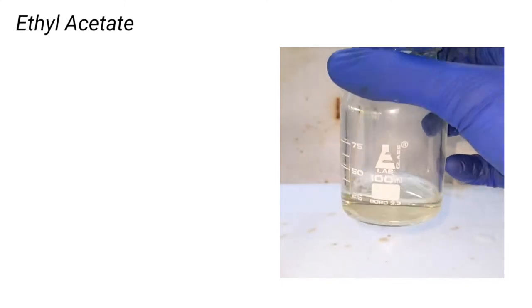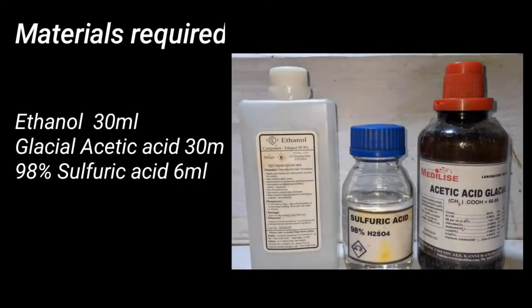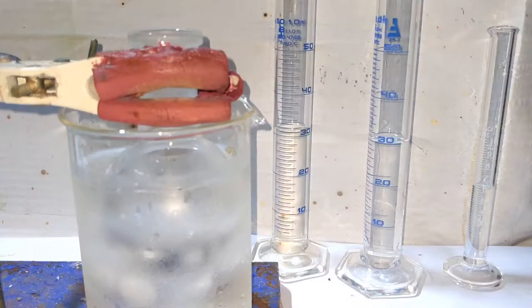Materials required for this preparation include 30 milliliters of 96% ethyl alcohol, 30 milliliters of glacial acetic acid, and 6 milliliters of 98% sulfuric acid. Here we have the reaction vessel, a 100 milliliter round bottom flask, and all the chemicals pre-measured and lined up.